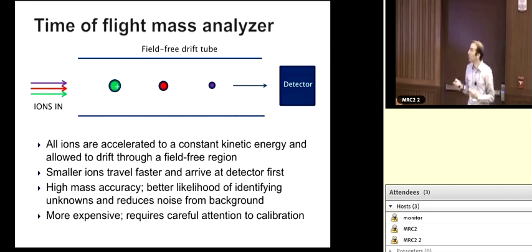Well, it turns out we can do more. Some instruments have the ability to, once you're inside the instrument, take ions that are already generated and fragment them. One simple way to do that is to ram these ions into other molecules or species inside the mass spec. So we might collide them with some sort of gas like argon or nitrogen. When you get these ions zinging in and ramming into other molecules, that imparts some energy into those ions, and it causes them sometimes to break. This basic technique is called collision-induced dissociation, or CID. Other methods of doing this exist too, and you get multiple fragment ions out.